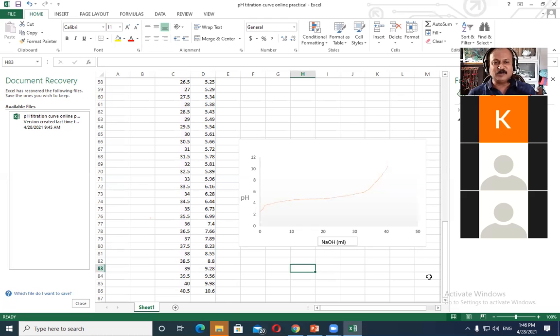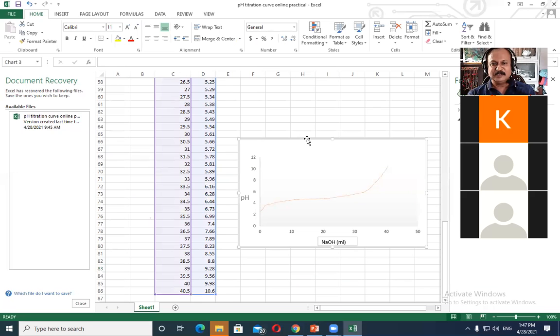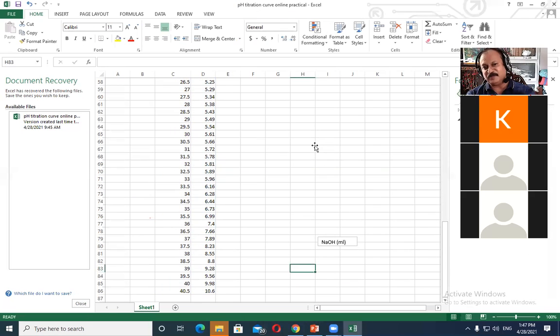क्या नहीं सबको हो सकता है ना ये? Everybody can do that on Excel. Okay, shall we revise it again if you want?